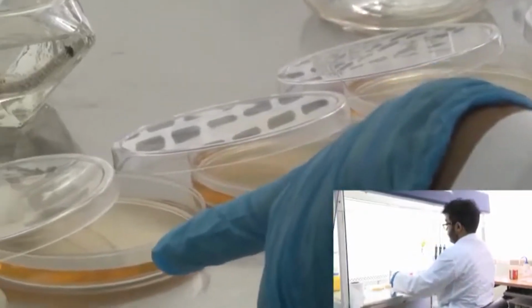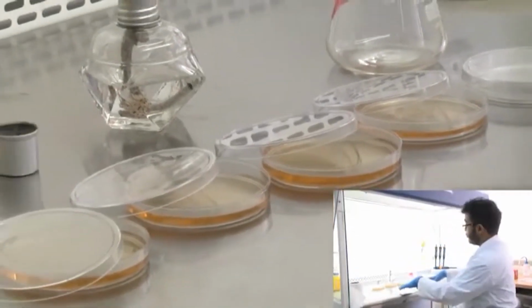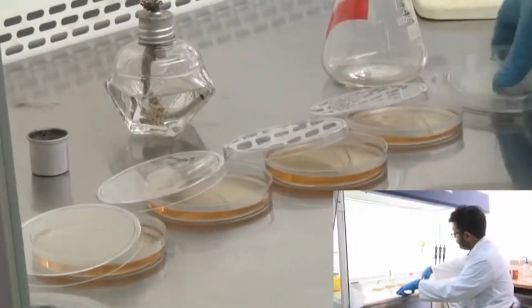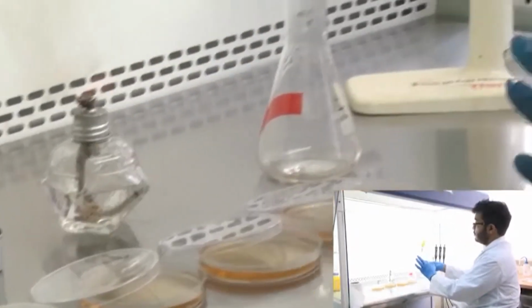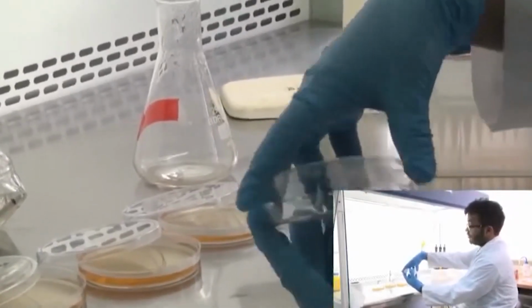Poured 4 plates, and we are going to let these solidify. It is going to take some time for these plates to solidify. So, what we did was we had taken this plate. This was a sterile plate. I am not pouring media, but I will just open it to show you what it is like.